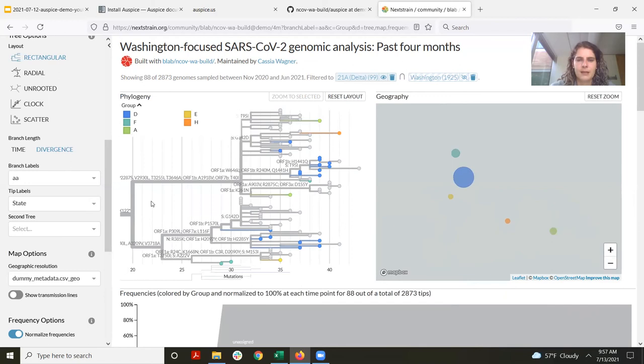In addition, we can change our branch labeling from clade to amino acids. Now it will actually show any amino acid mutations that have occurred on those branches. For example, we have G142D in spike up on this branch. To go back to the full tree view, you just click the root node a couple of times and it'll take you back to whatever view you were on. So now we're back to looking at 21A delta, and we'll change branch labels back to clade.